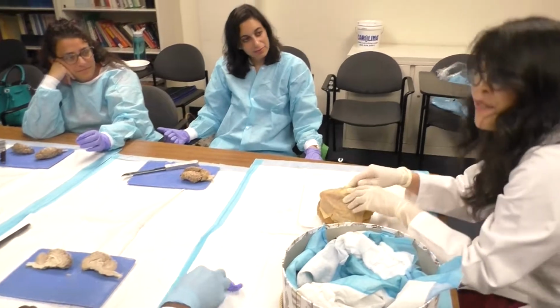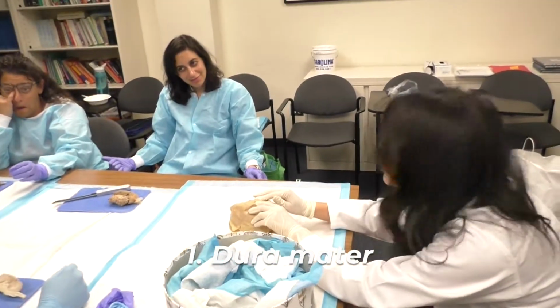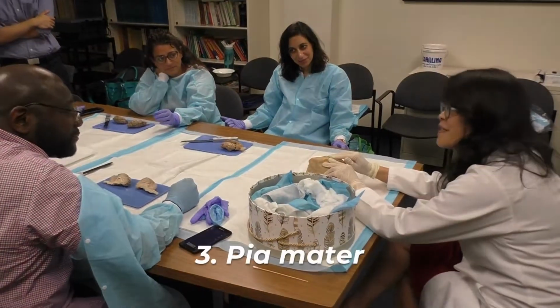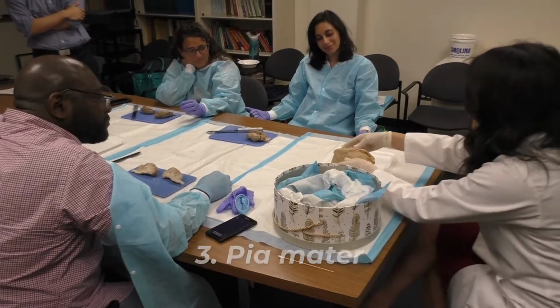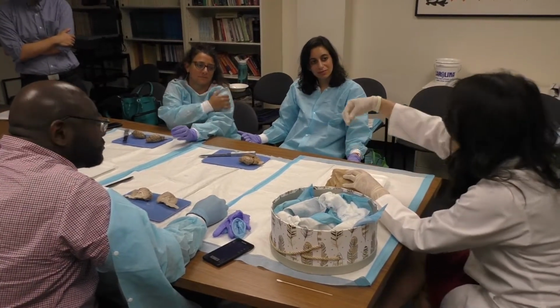But there's 3 layers of the meninges. Does anybody know what the second and third is? Dura mater, arachnoid mater. What does that mean? Spider mother. And pia mater. What does pia mean? Gentle. Soft. Yeah, exactly.